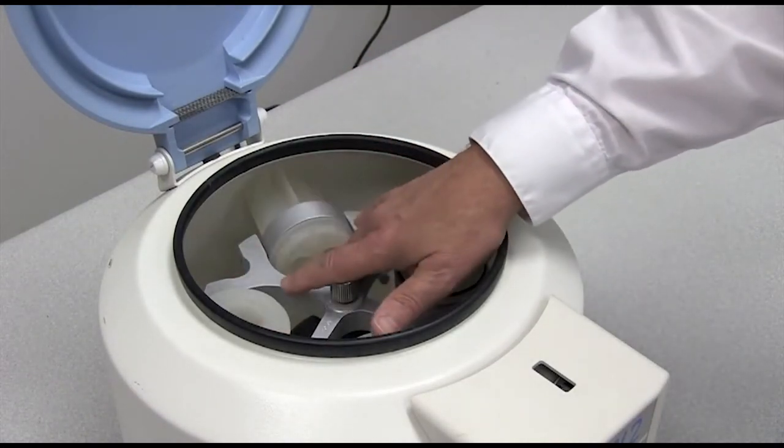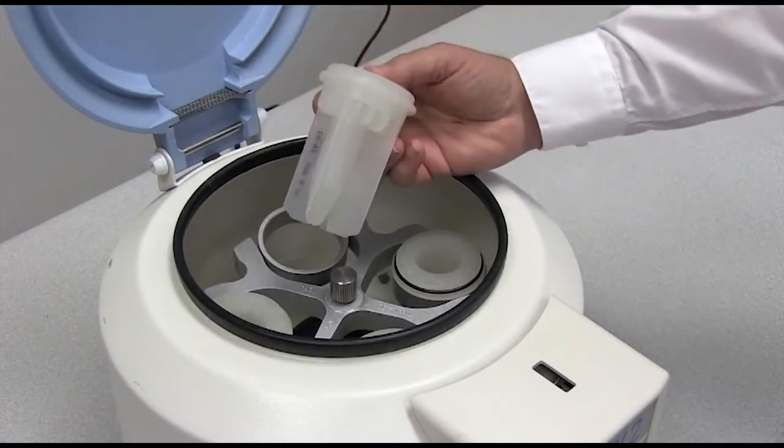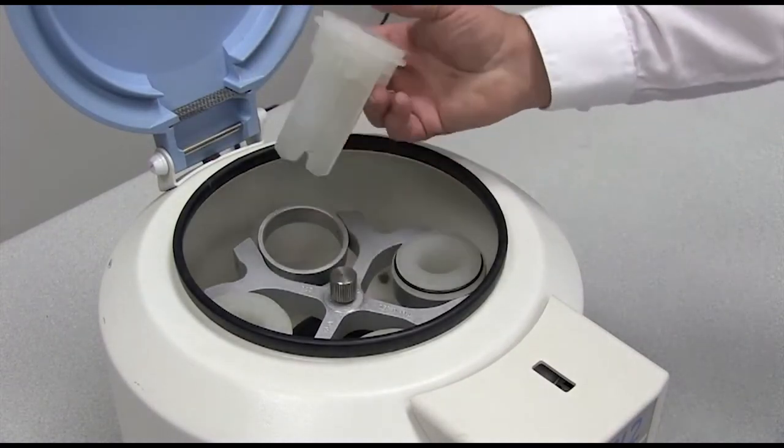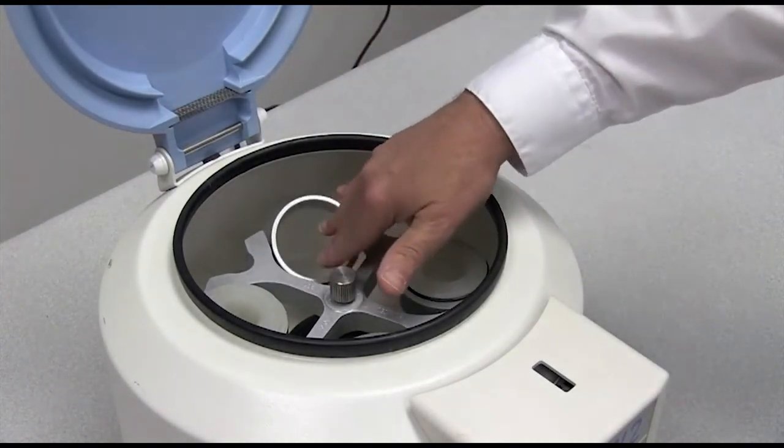This, as you can see, is a swinging bucket rotor so that these swing. They have the removable buckets or tube carriers that fit into these rings. We call these rings trunnion rings.